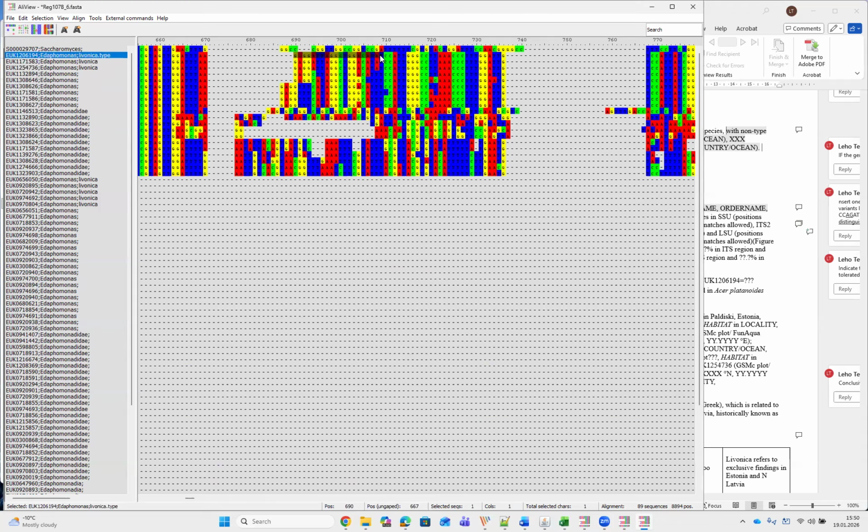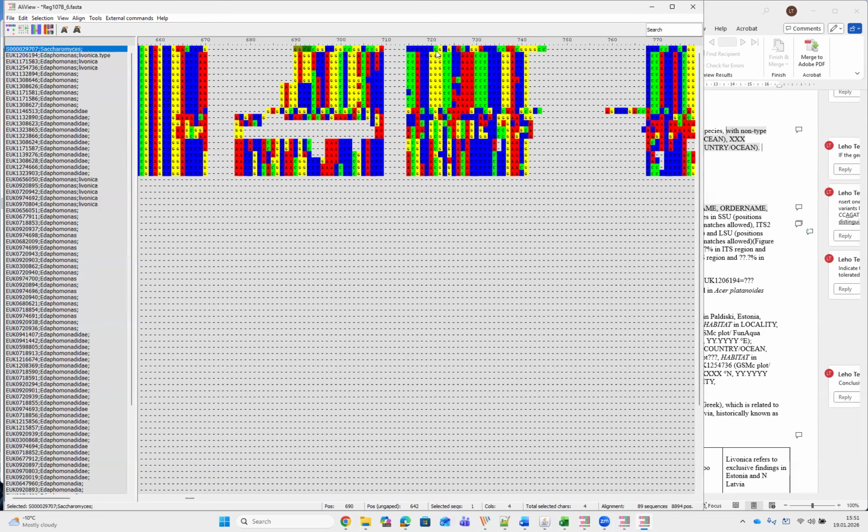Our preferred standard is 20. So we can take this part, just for clarity, and take this other part away so that we can focus only on this. We also see that the Saccharomyces alignment is matching, so we don't have to worry about these exact positions.